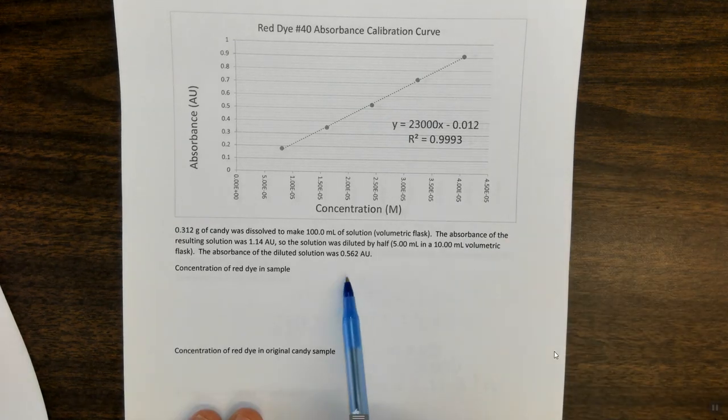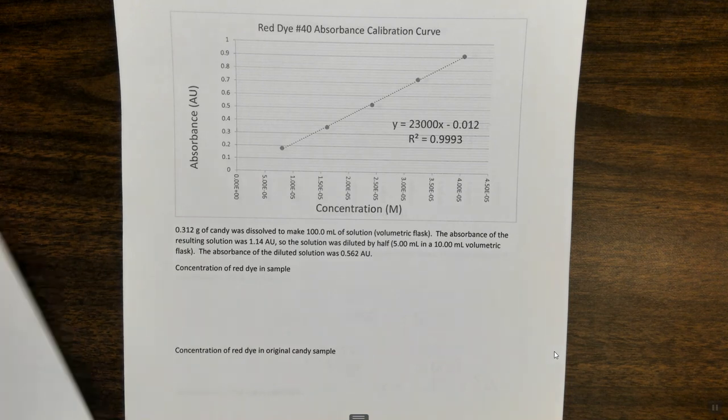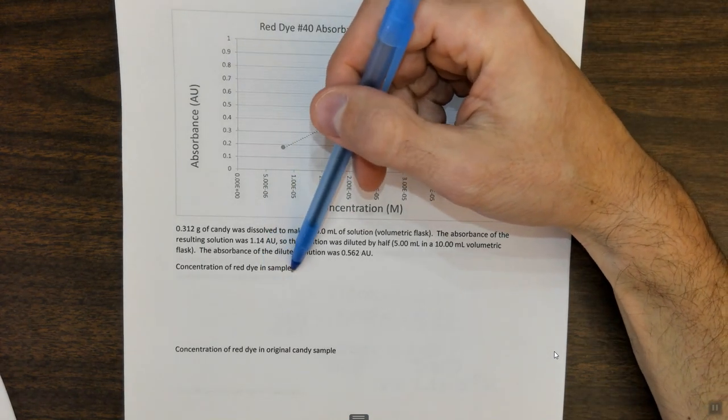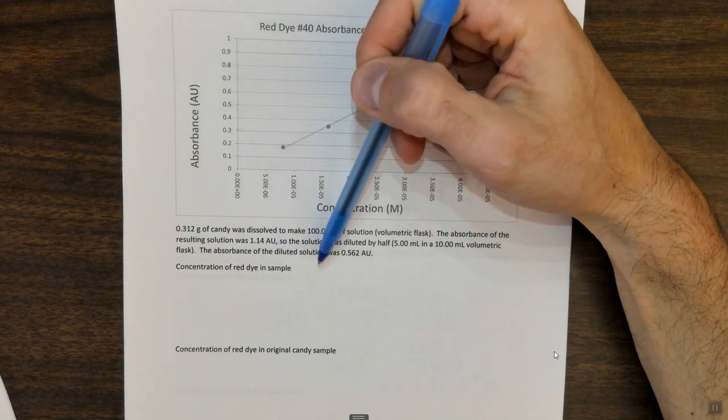So the first thing that I want to do is figure out the concentration of the red dye in the diluted sample. So this is the diluted sample.